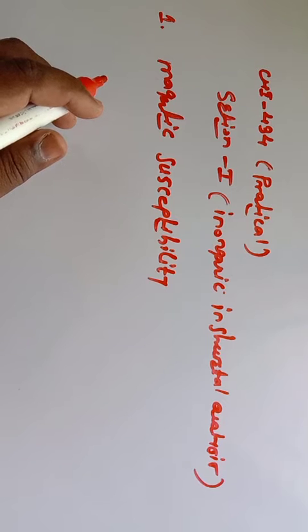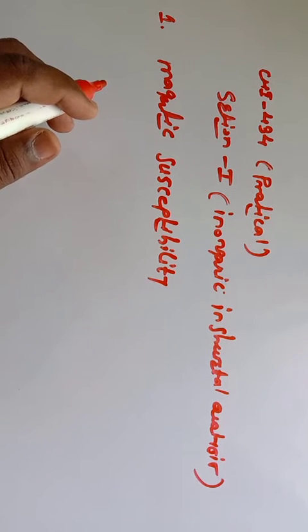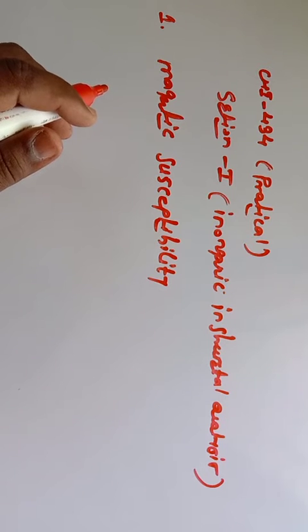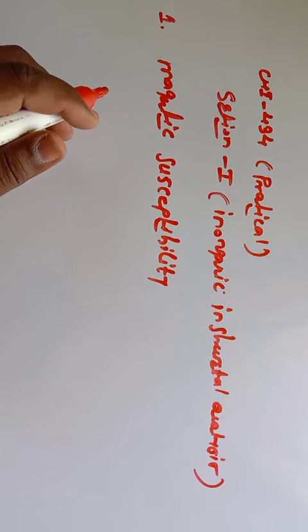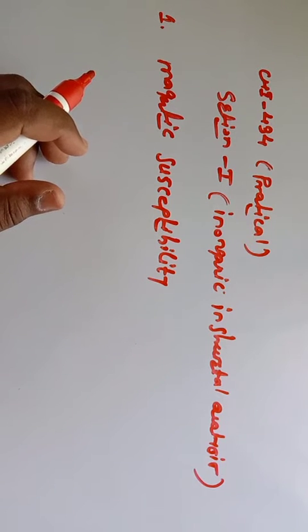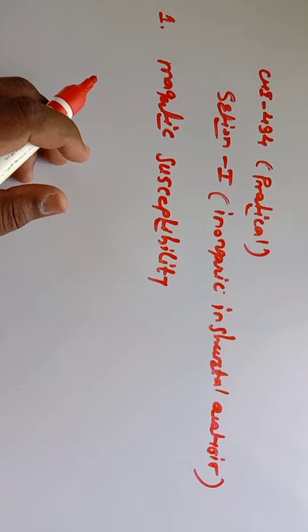Whatever the sample, that is the material which has a magnetic character in it, can be analyzed by different methods, and we can determine the magnetic susceptibility of that material.